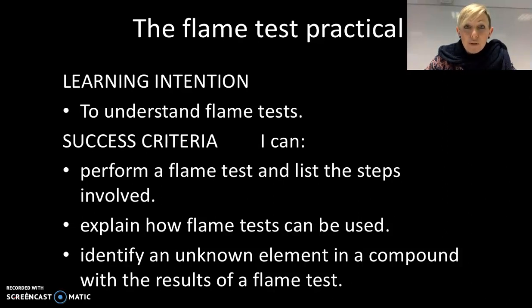And today what you'll do is heat a range of different ionic compounds in a Bunsen burner. You'll identify the colour that is being emitted from that flame, and you'll be able to use that information to identify unknowns next week. Before you start, we are looking at page 41 in your booklet titled The Flame Test.